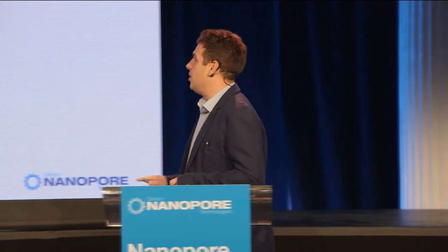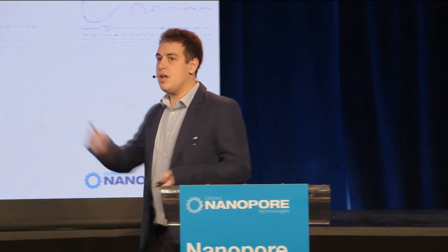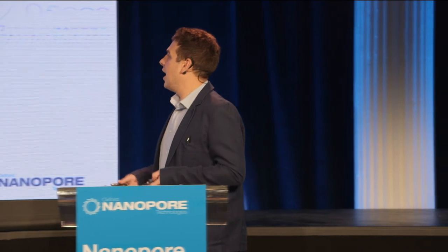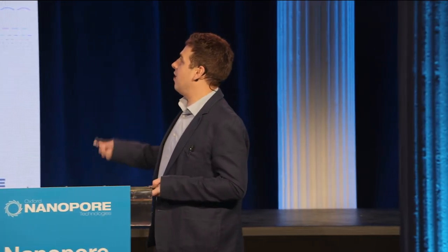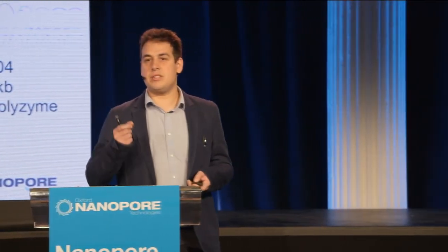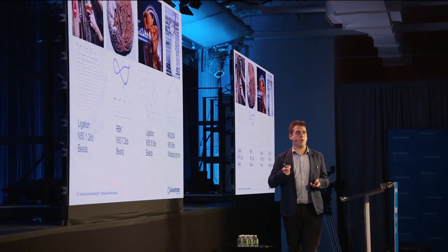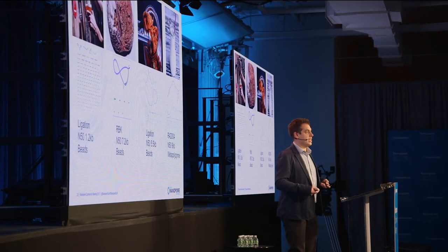Not only that, they are also extremely useful mock communities for benchmarking, trying to reconstruct microbial communities from long reads. So this is what we've been doing, things like our PoreCamp course, and other courses we've been generating. This is a kind of nice material to work with. And just some results here. We can actually take these reasonably simple polymicrobial communities and reconstruct whole genomes, long contigs.